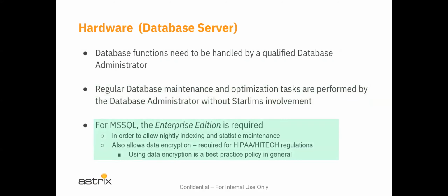So for Microsoft SQL, the thing I didn't mention previously was that STARLIMS operates under either Oracle databases or Microsoft SQL databases. But for the Microsoft SQL database, the Enterprise Edition is required. That is because it allows additional functionality that is required to allow for redundancy and fail-safe, such as nightly indexing and statistical maintenance.